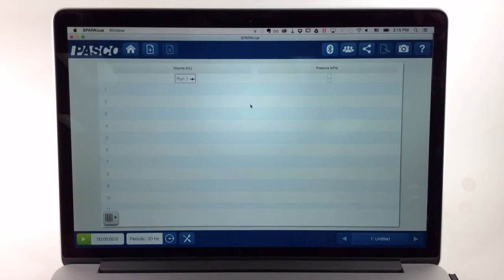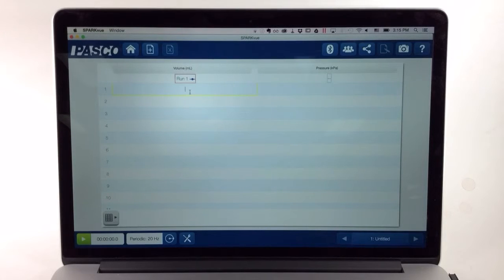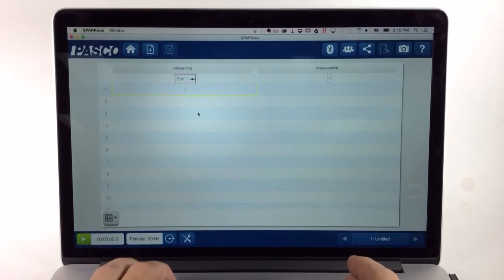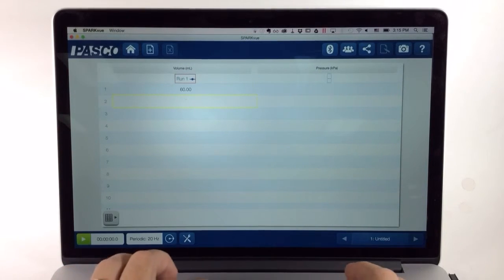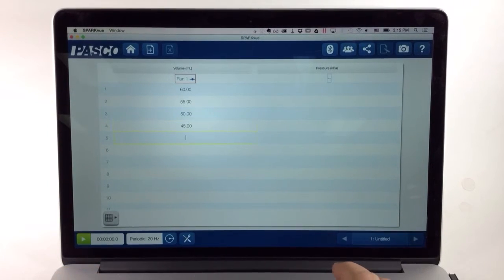I have my two columns now set up. If I want to, I could begin to fill in the volumes I'll be using before I even start recording data, or I could do this while recording or even after recording.